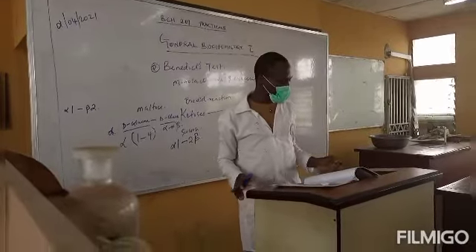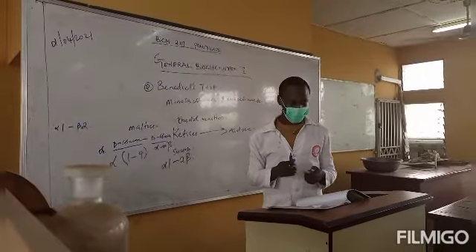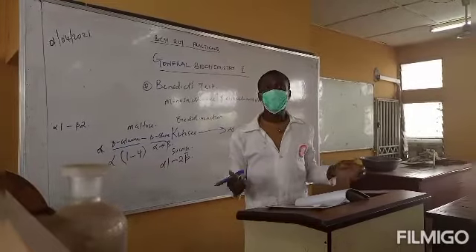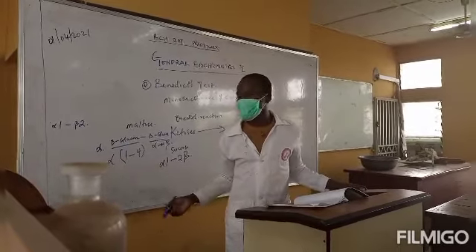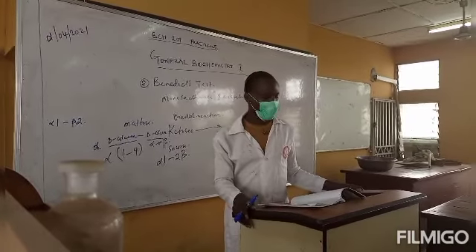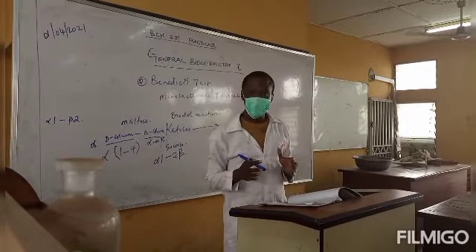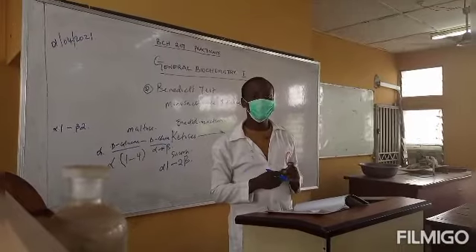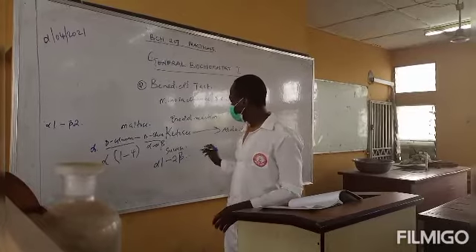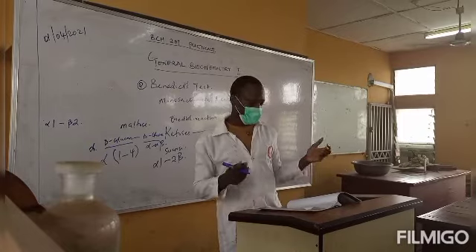All right. So we've already seen how disaccharides and monosaccharides react to Benedict solution. The next one we'll look at is polysaccharides. Polysaccharides give negative results with Benedict solution because all the anomeric carbons are used in bonding. We know that a polysaccharide is a polymer of glucose, joined in alpha 1,4 glycosidic linkage.